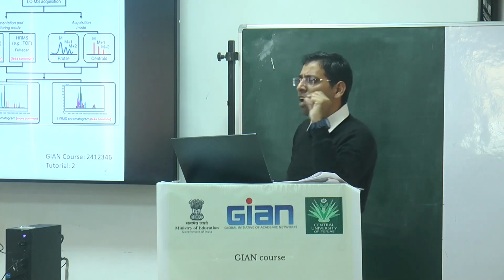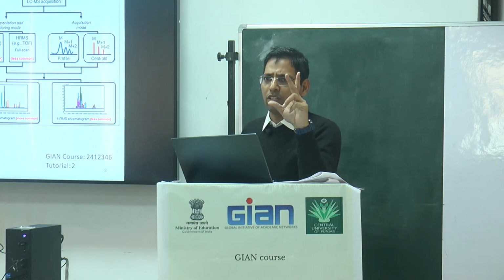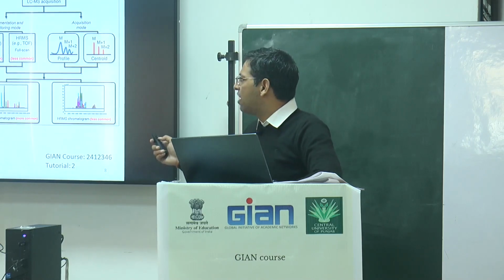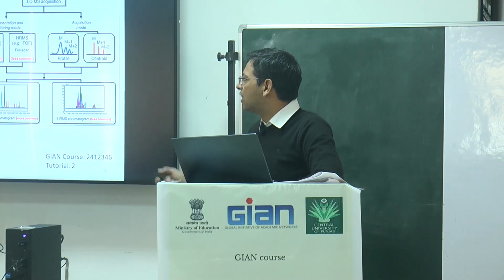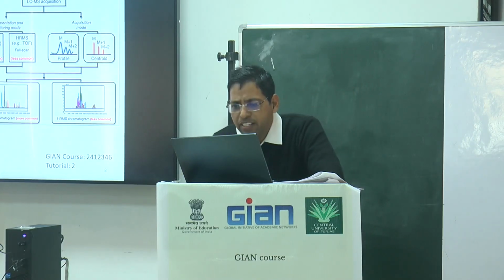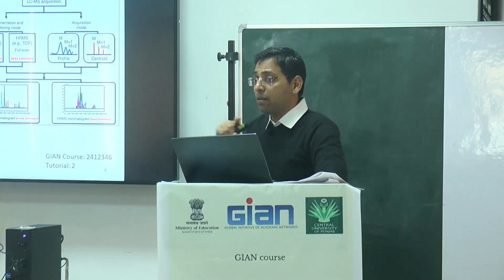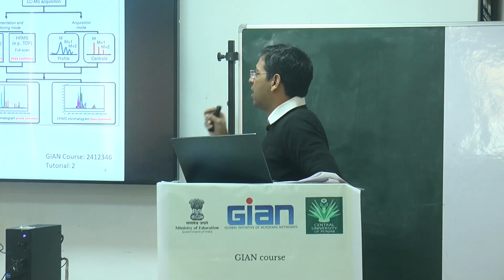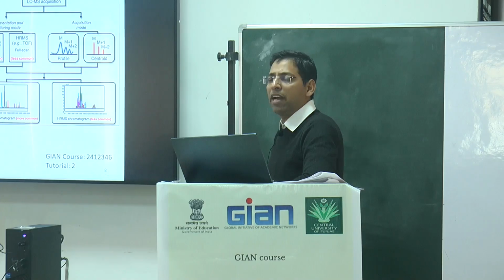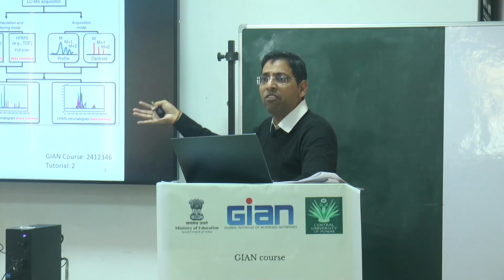Now, we can analyze the data in 2 different modes. First is the centroid and second is the profile. So you have to find out which one is the best for you. Centroid mode basically creates small files, but many times loses information. Sometimes it is necessary, always remember that. Profile mode retains the information, and allows better identification of the metabolites. We are going ahead with the profile.